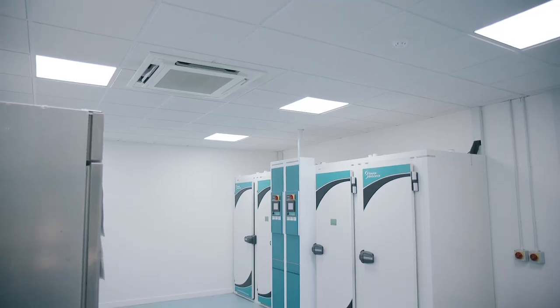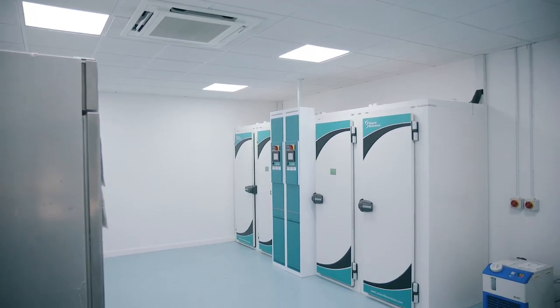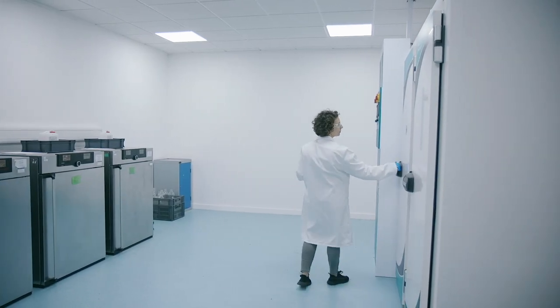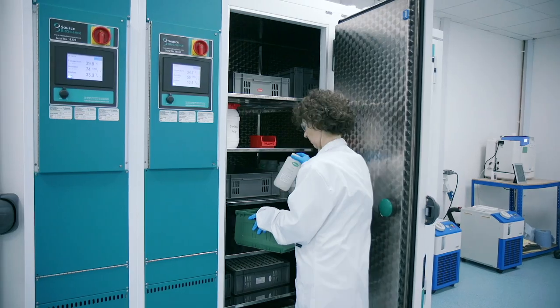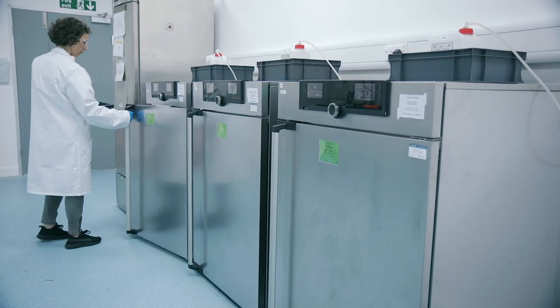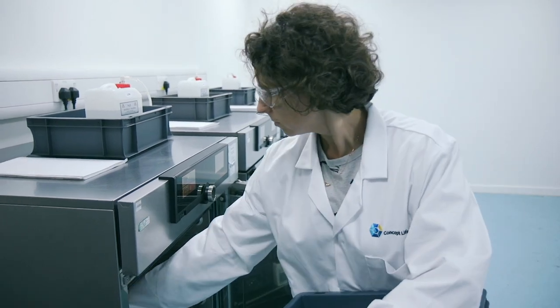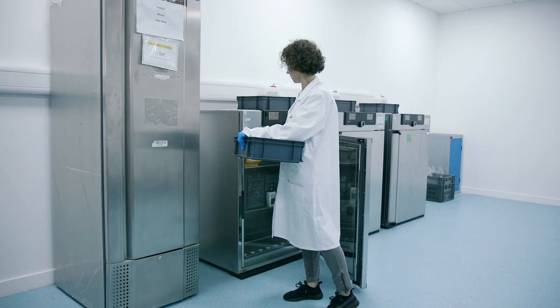This is our storage stability suite. Floor-to-ceiling reach provides plenty of capacity at the standard ICH long-term and accelerated conditions, and we have several smaller cabinets to cover a wide range of other conditions. All cabinets are fitted with alarms, constantly monitored, and supported by an emergency generator.